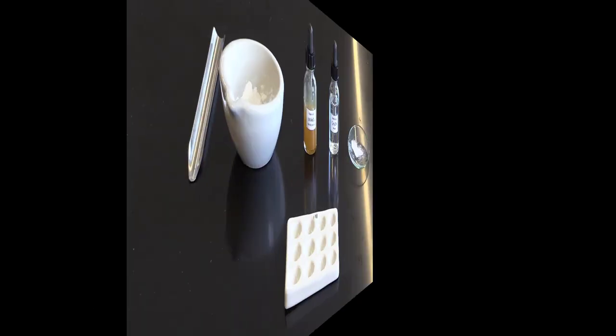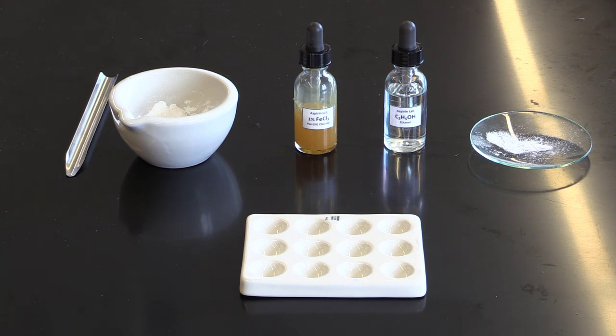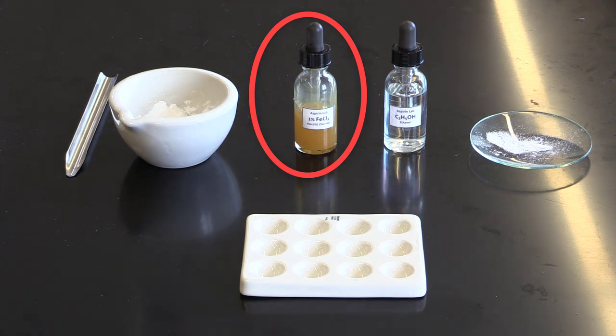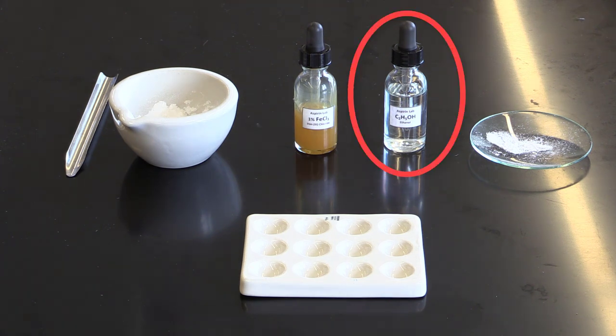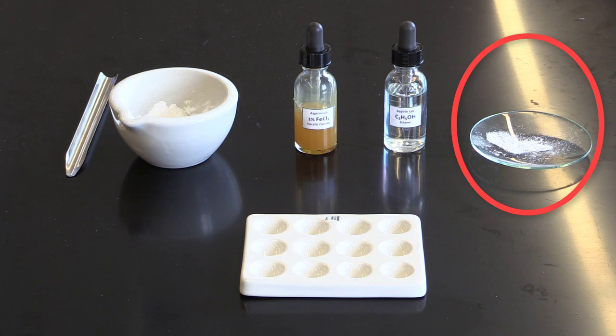Alright, so now let's get started with the test. What we have for this test is our iron 3 chloride and ethanol. The ethanol will be used to solubilize our dried powder aspirin, which is shown in the watch glass.